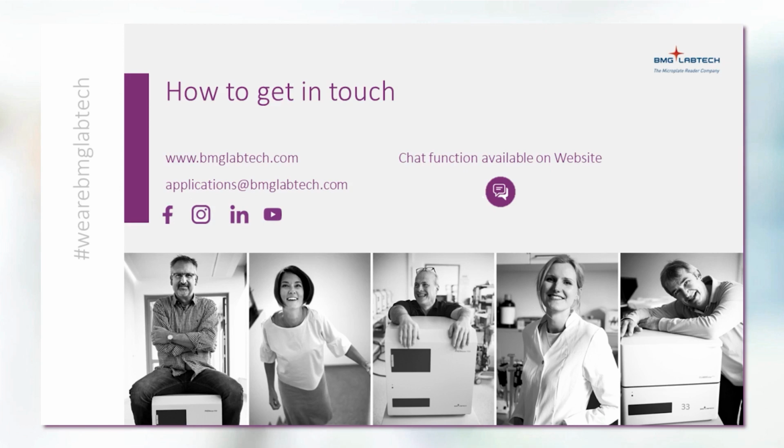The next question is stating, in their institute, they have different readers available for use. Should I use the same gain on all readers to keep the data comparable? Yeah, so we typically recommend to optimize the gain value for each device individually.